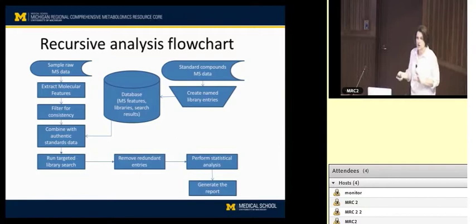You want to capture what is most likely to be the most intense form of this particular metabolite so that you don't miss it later when you're trying to match against it. So this part all happened before we really started running samples and before we started running the untargeted metabolomics workflow for people.